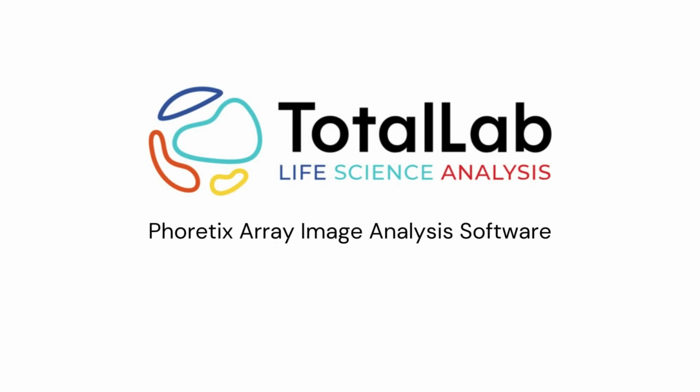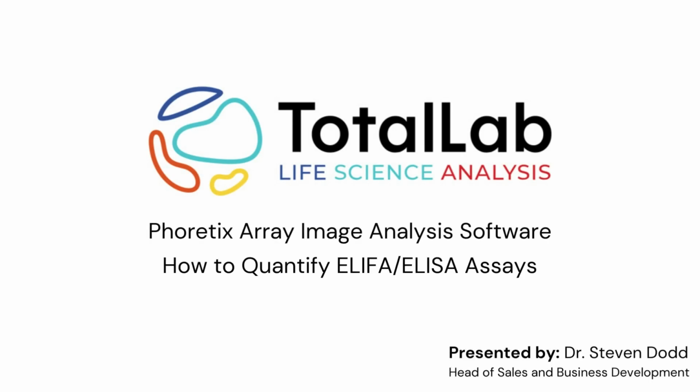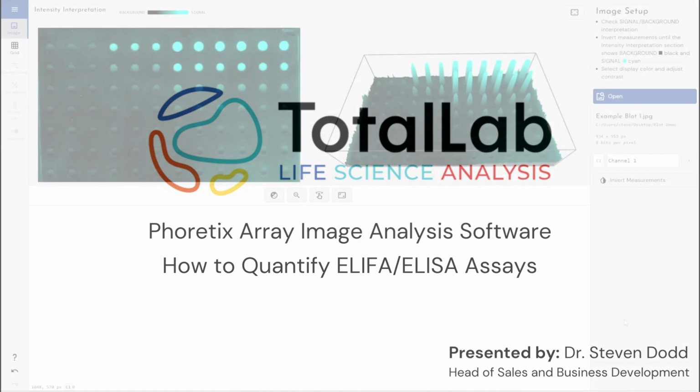Hello everyone. Today I'm going to be showing you how we can use our new Phoretix Array image analysis software to easily, quickly and most importantly accurately quantify enzyme-linked immunofiltration or enzyme-linked immunosorbent assays.